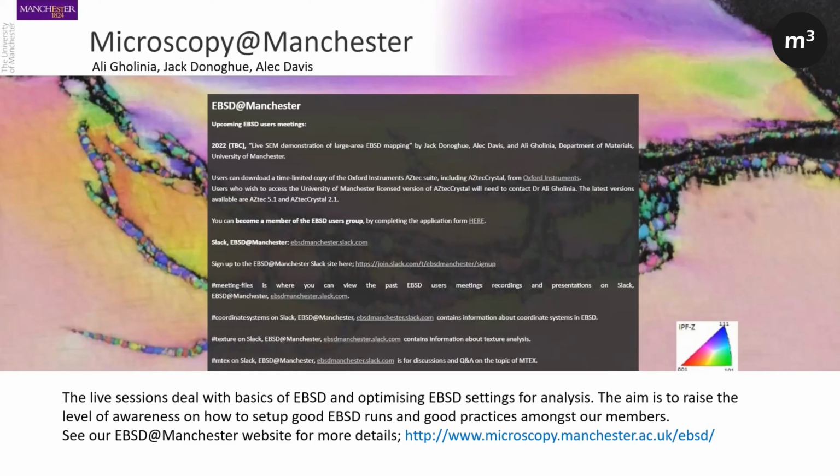And also we have some training videos which we prepared, which we will do as well in the near future. So there's one on large area EBSD which we'll confirm in the future.